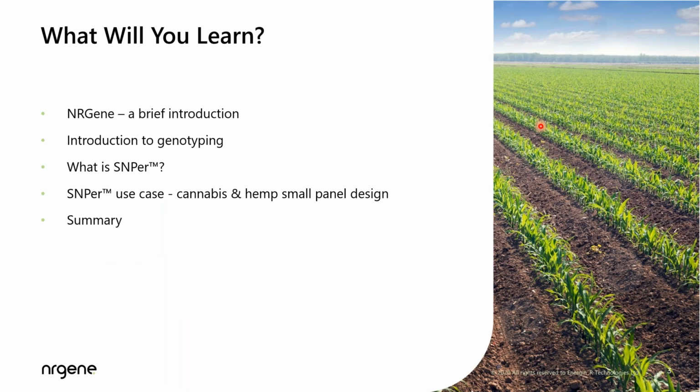Thank you, Jana. We have a lot to share with you today. A brief caption of what's going to happen: I'm going to give a very brief introduction into Energen, in case some of our audience has not been in contact with us in the past. A very small introduction to genotyping, what is it good for, why do we want it, and then SNPer, the topic of today's talk. I'm going to showcase a specific use case with real data that we've recently done, establishing a small SNP panel for cannabis and hemp genotyping.